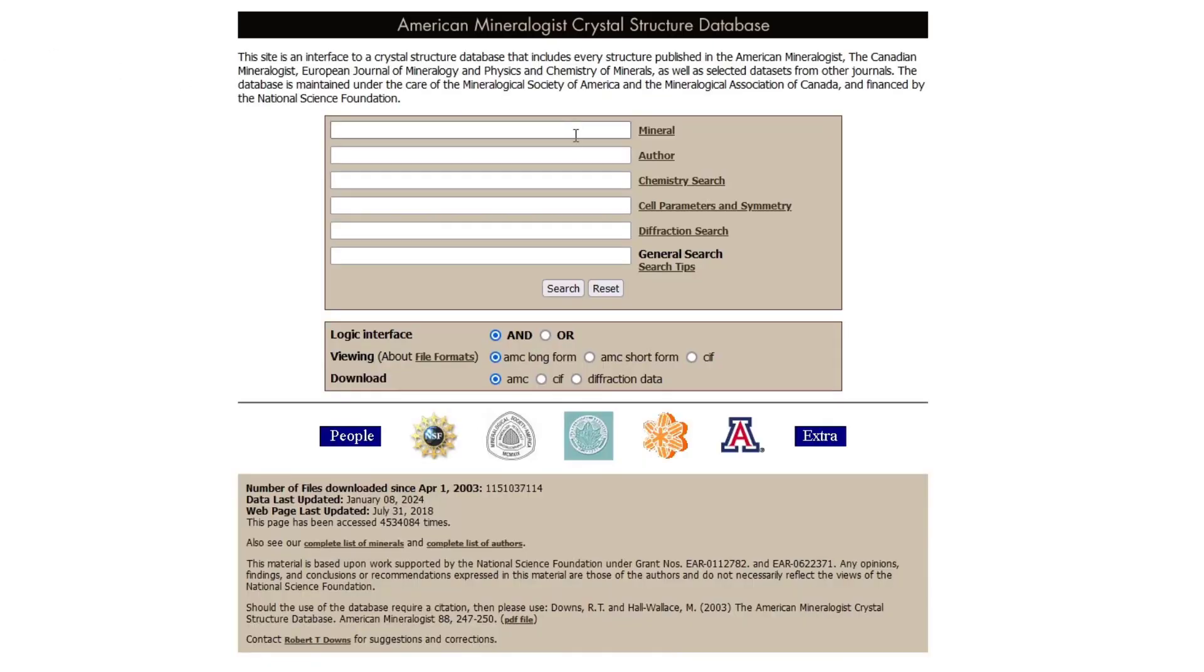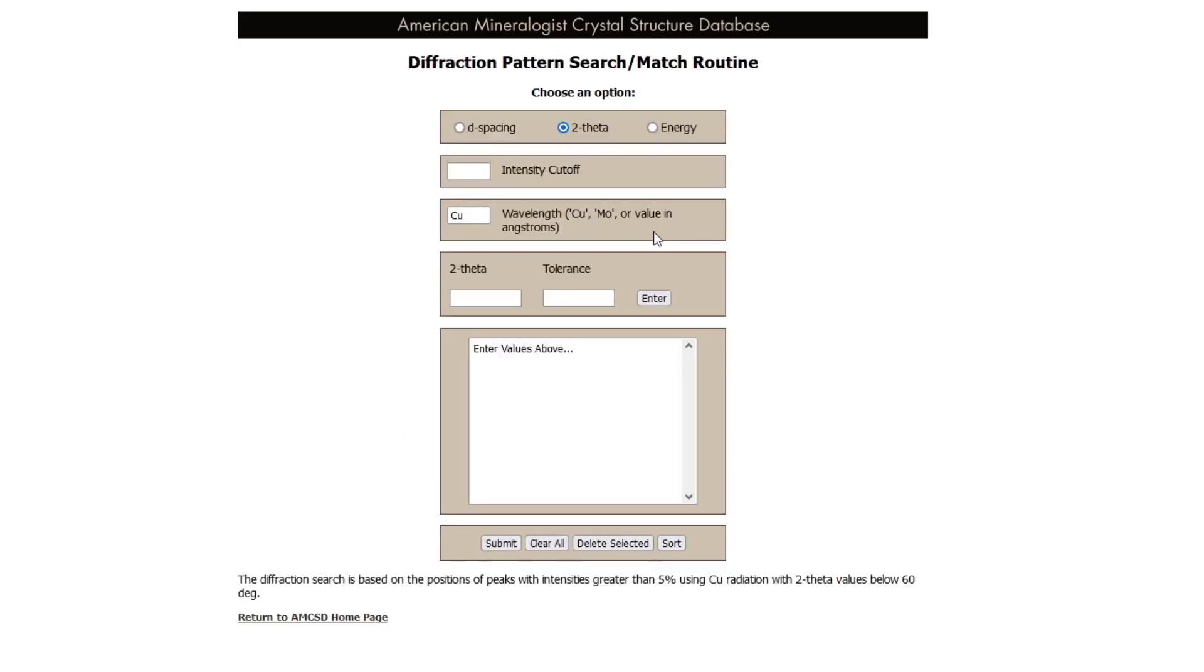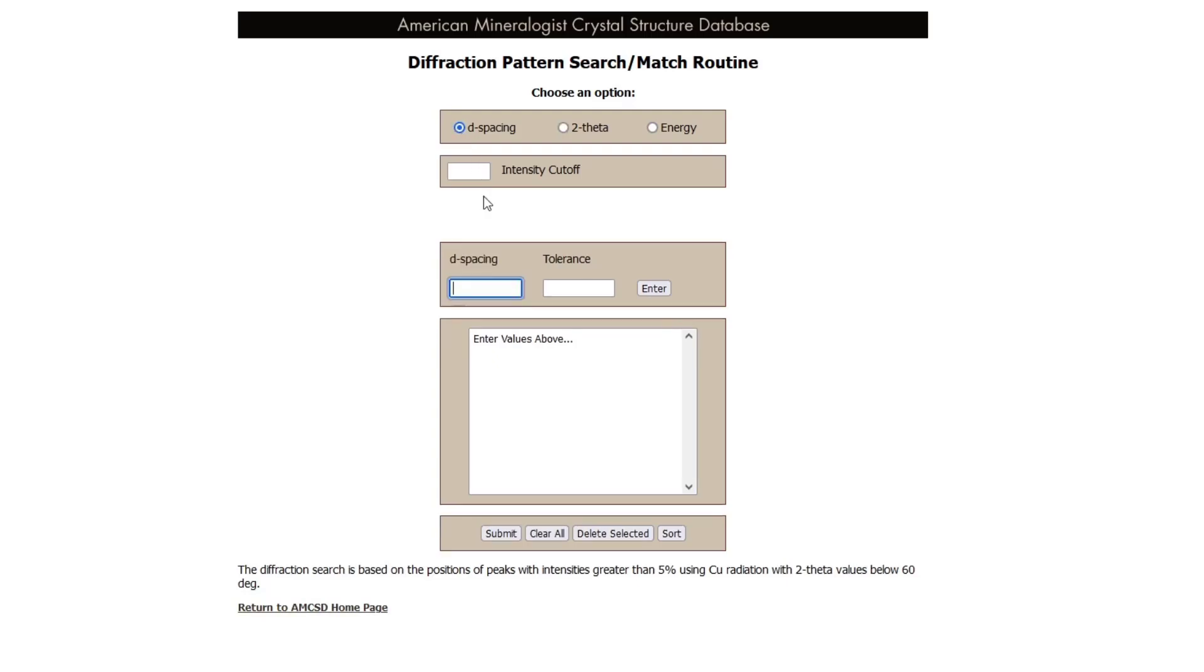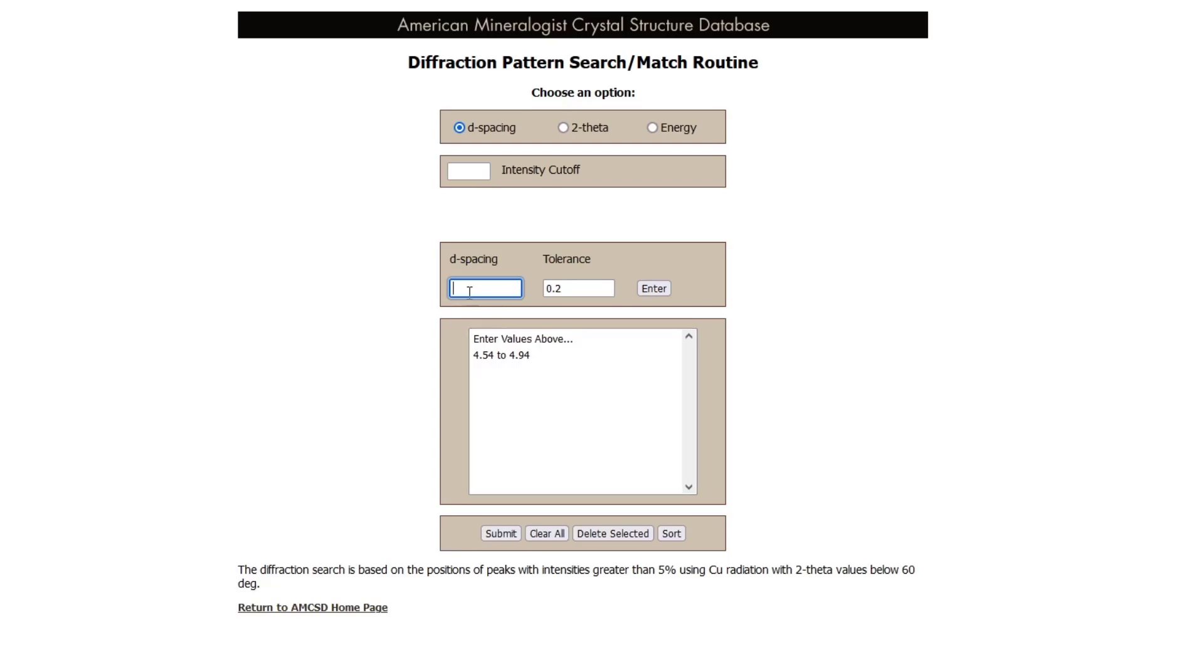We can also use our actual diffraction data that we just obtained, and in this case we want to use the D-spacing option. We'll type in the D-spacing for those three rings, and you type in the value and you add a tolerance, so plus or minus what. So here I say 0.2, maybe that's a bit too high, maybe you want it to be more constrained. You can continue doing that for however many D-spacings you would like.